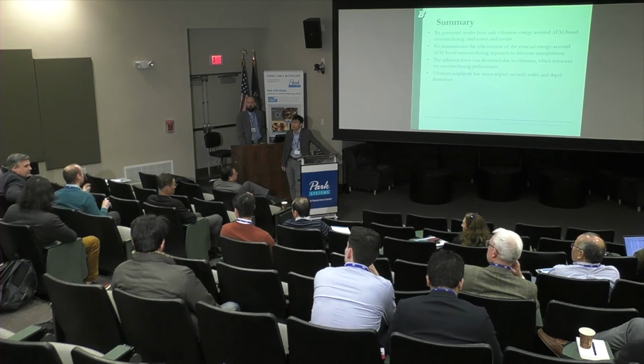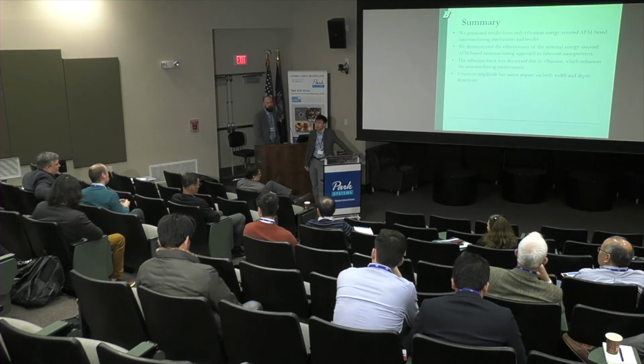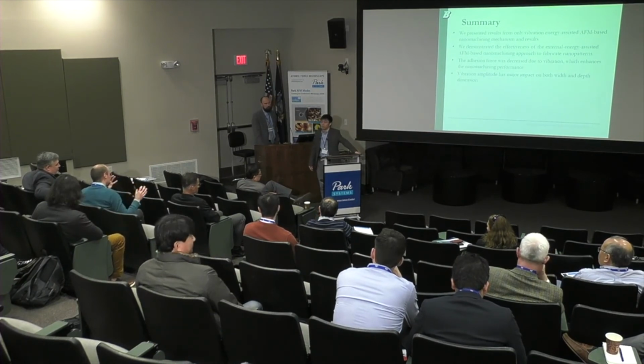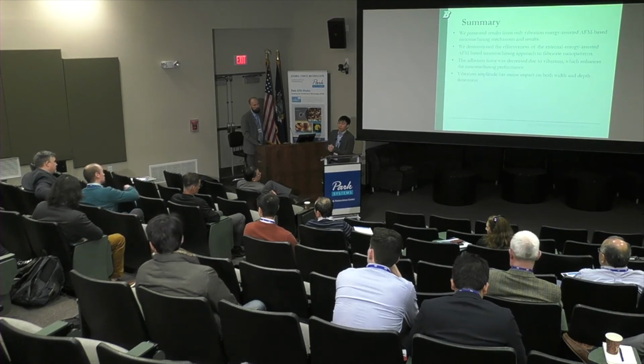Thanks. The throughput of this: how long would it take you to make anything of an industrially useful size with a single tip, or is there a way of multiplexing? For one pattern I showed, maybe the Steve Jobs, or the ICE, they are about 2 by 3 micron. They typically take 15 to 20 minutes to finish one 2 by 3 micron pattern, depending on the size you need. But actually, when we do experiments, the setup time is much more than the machining process. If you were comparing it to lithography used in the semiconductor industry, are you putting millions or billions?